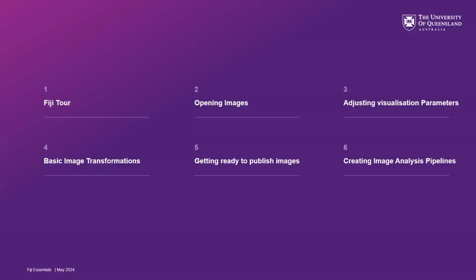So the plan for the day is to start off with a couple of slides on background of Fiji, and then work our way through from opening images, playing with them to make them look good, doing some basic things that change the image shape or outputs, how you get ready to publish with things like scale bars, and then working up to analysis pipelines.